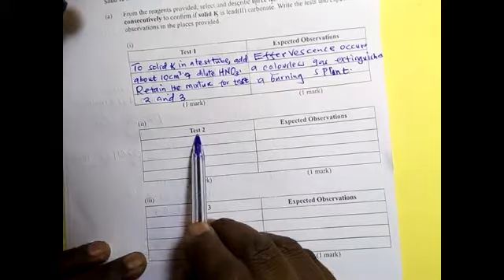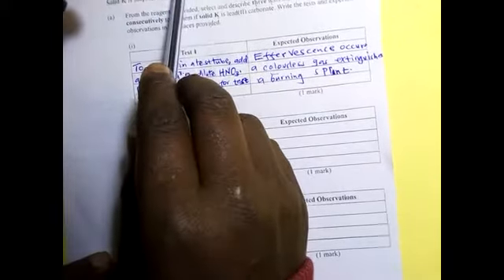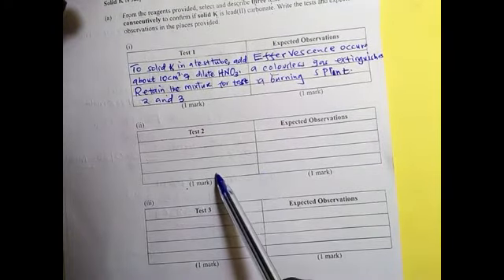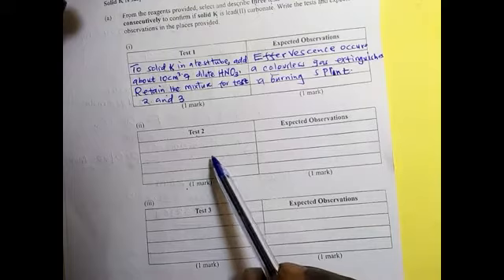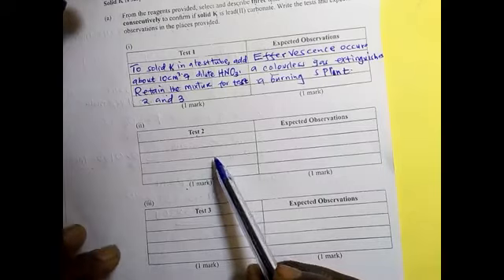Test number 2. Now we have the reagents aqueous ammonia and then sodium sulfate. You cannot use the sodium sulfate before you use ammonia. So ammonia will come before the sodium sulfate.